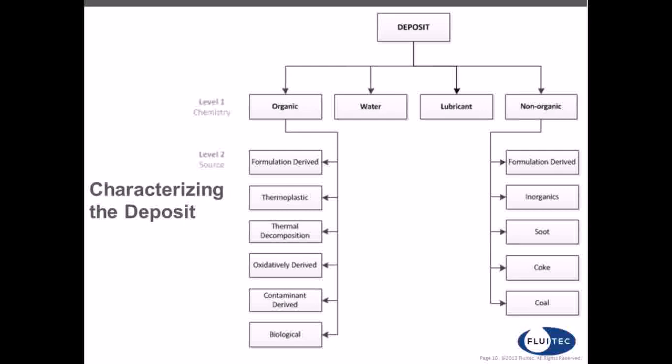On the non-organic side, we also have formulation derived. An example of this would be zinc alkyl dithiophosphate. ZDDP is a very common anti-wear agent used in hydraulic applications. As that molecule gets consumed and starts to react, it will form some phosphates and sulfates, and these are inorganic components in the deposit that are formulation derived.